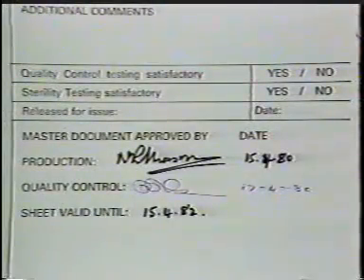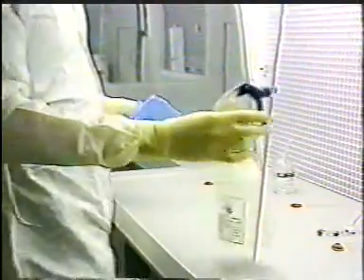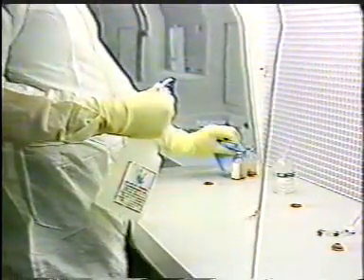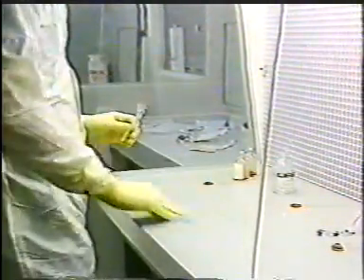Our next consideration is the manufacturing process. This is carried out in accordance with documentation, which has been approved by the quality controller. The rooms in which manufacture is carried out must be in a good state of repair and decoration, and must provide an environment of the appropriate standard.